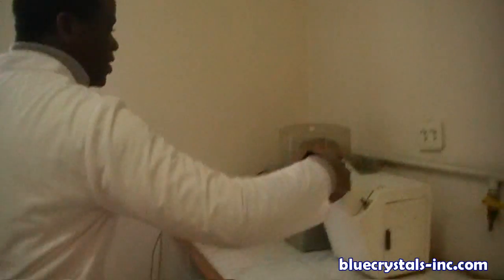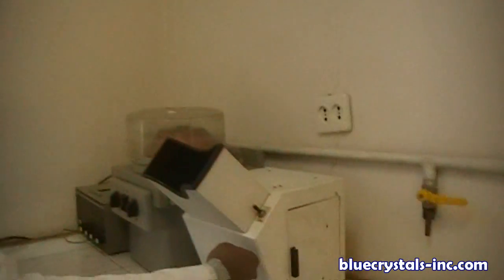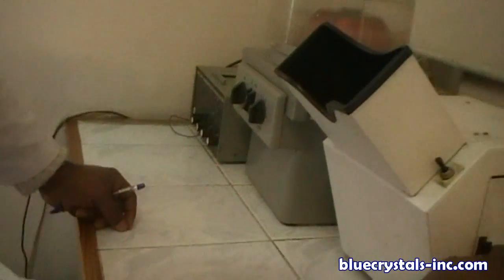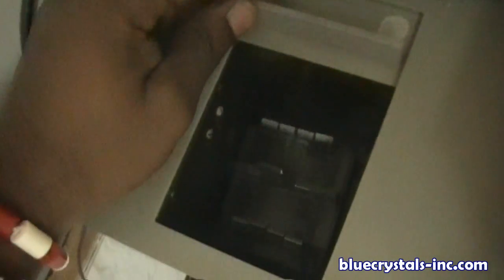And this one is for measuring — photo color, photocolorimeter. You're posting a test tube here and check. This is a centrifuge — centrifield — where you put your material to centrifuge. And this yellow one is for absorbance.